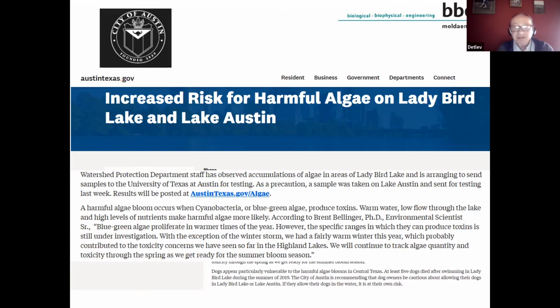This is the typical, traditional way: to take a sample, bring it to the laboratory, and perform the analysis. That's okay, but if you want to know what is currently in your lake, you need a much speedier investigation. And so it is often asked to have a management action when you see that such harmful algae could be inside of a lake.